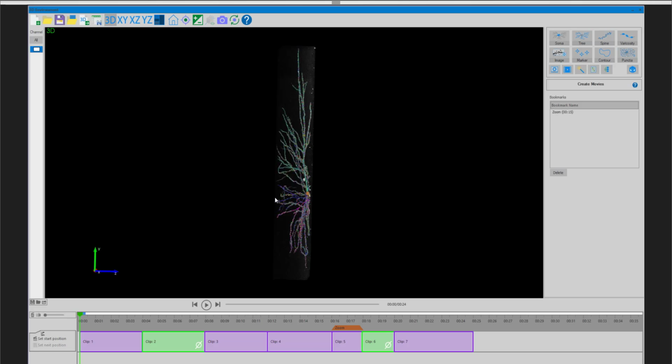For instance, if you have a much smaller or much larger data file, the rotations might not move around the same axis point, and the zooming and panning might not make it through the entire stack. If it's large, if it's small, it might move the entire thing off the screen. So just be aware that the scripts are useful for the same pixel dimensions and resolution.